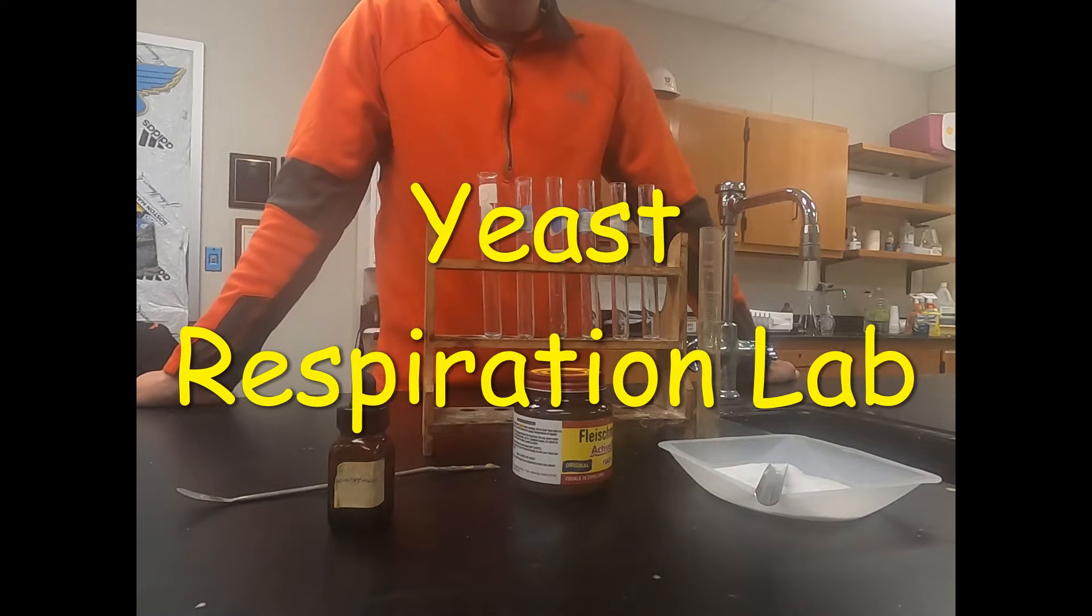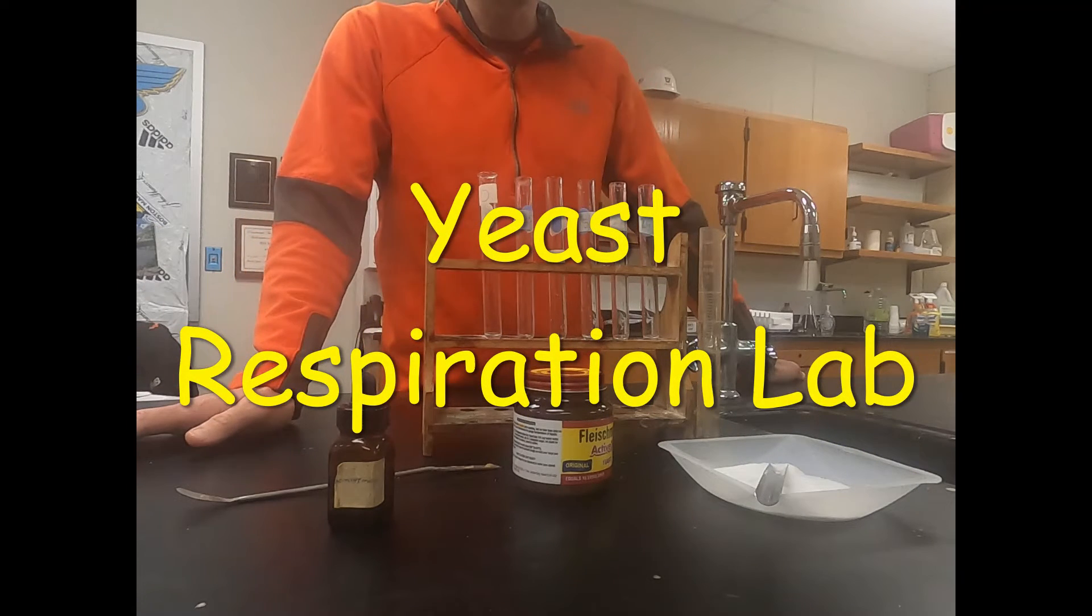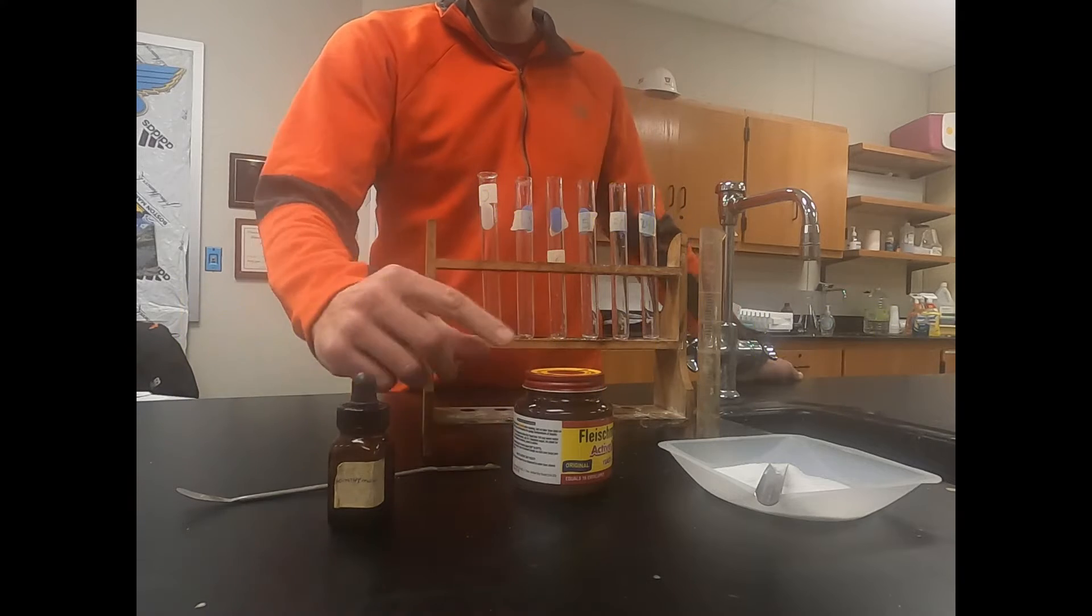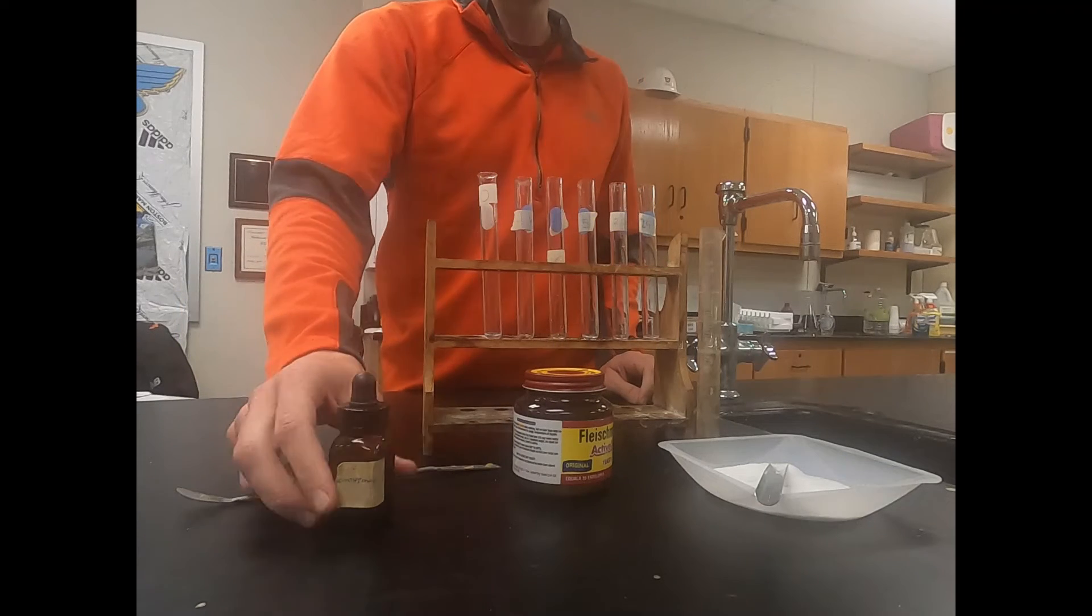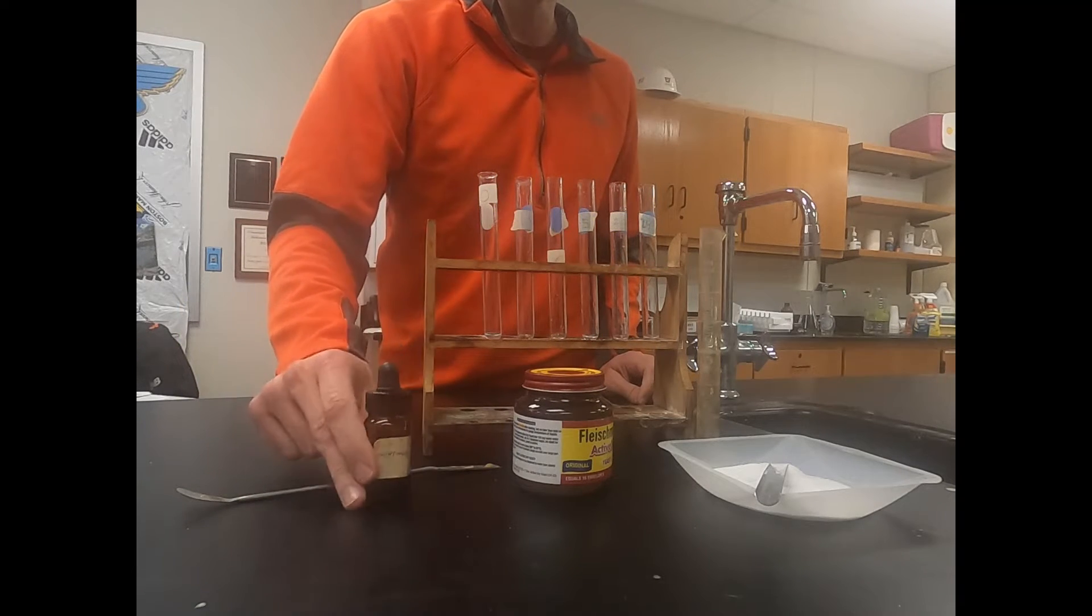Hello and today we'll be working with a cell respiration lab dealing with yeast, sugar, and we'll use bromethyl blue as our indicator.